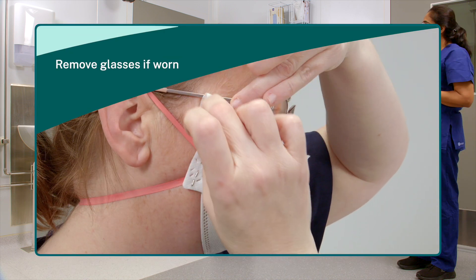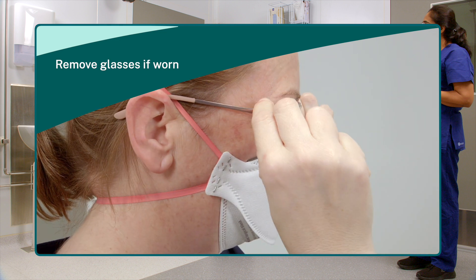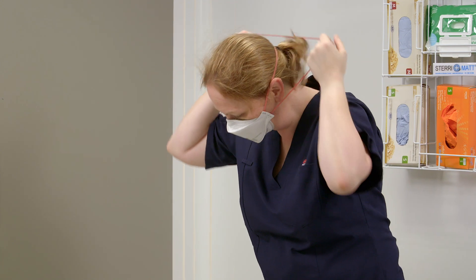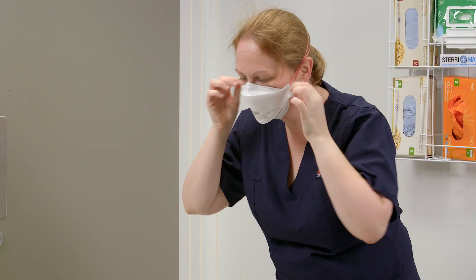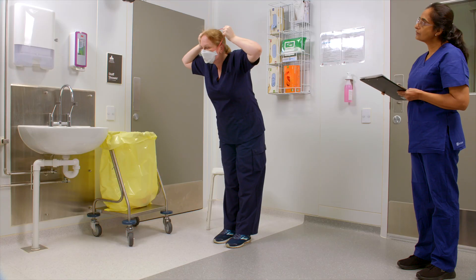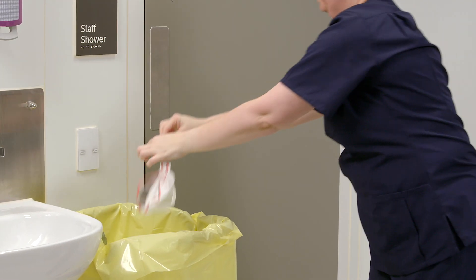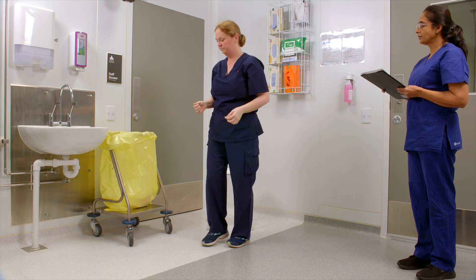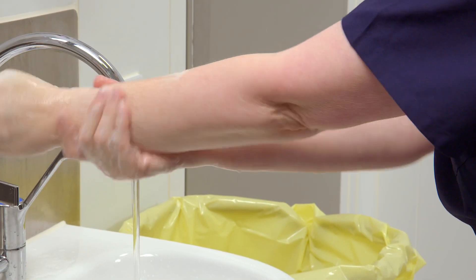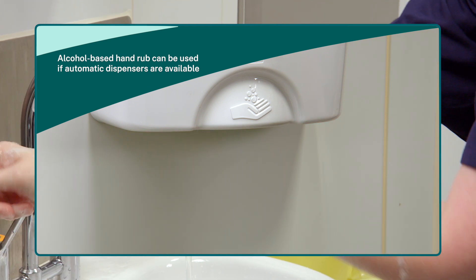Remove glasses if worn. Doff the respirator by locating the straps of the respirator. Bend at the waist, chin out, and pull forward in a downward motion removing the respirator. Now perform hand hygiene with soap and water including forearms up to the elbows. Alcohol based hand rub can be used if automatic dispensers are available.